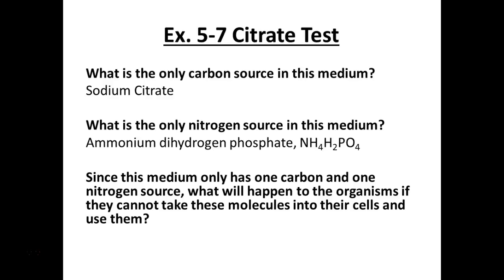Because of that, since this media only has one carbon and one nitrogen, what will happen to the organism if it cannot take in these molecules into their cells and use them? It won't survive. It will die. So if you have a non-bright blue tube and you think you're seeing growth on that slant, you're not.